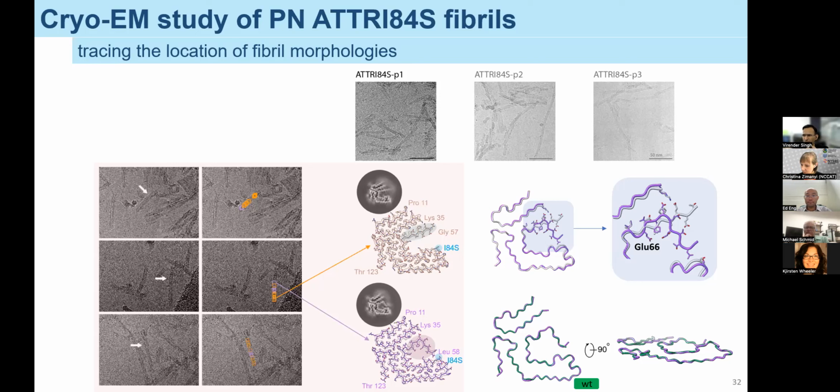We did mass spectrometry to find residues where we see that cleavage. Actually, it's not just in the disordered region. There are fragments which might be cleaved even here. And that could be one of the reasons that we are not hitting good resolution, even though the data set is good, because the layers are not exactly identical. There are fragments which are proteolytically cleaved, so we cannot actually build or get a good density map due to that heterogeneity.